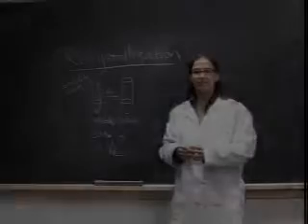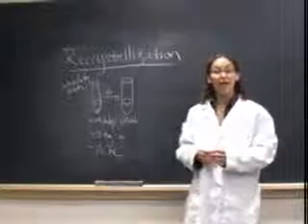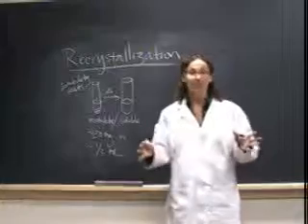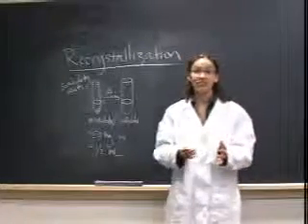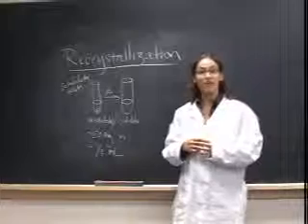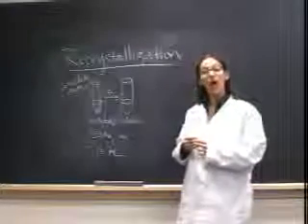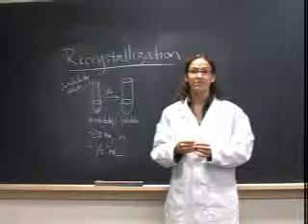Recrystallization. A large percentage of a chemist's time in the laboratory is spent purifying chemicals. Learning to use a variety of different purification techniques efficiently and effectively is key to becoming a successful experimentalist. Recrystallization is one powerful method for the purification of crystalline solids. This video will outline the purification of naphthalene by recrystallization.